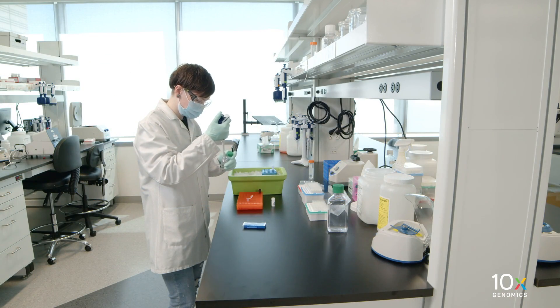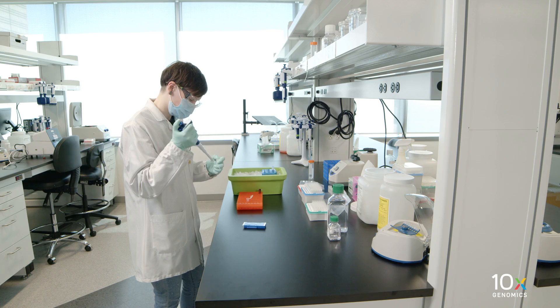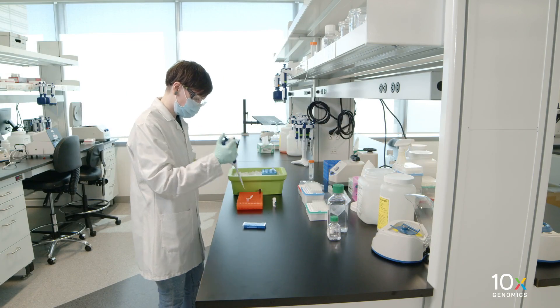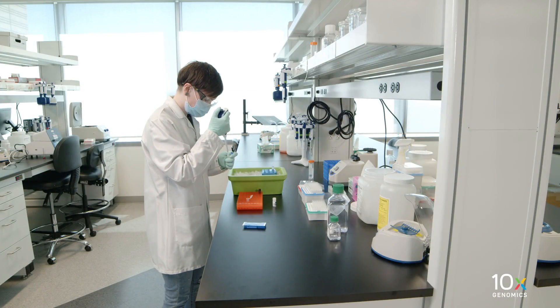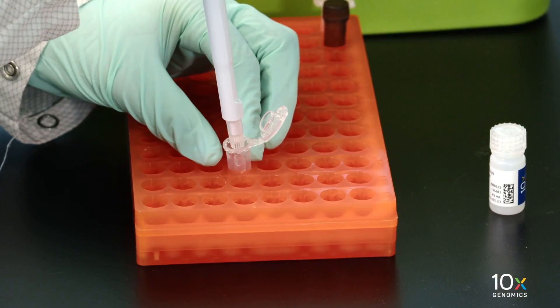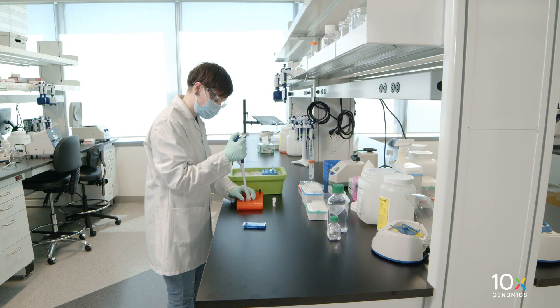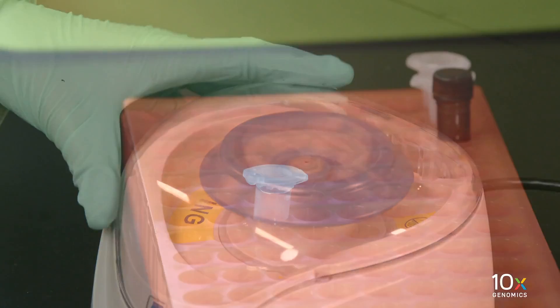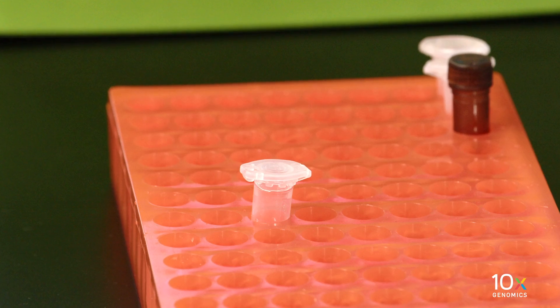Prepare the probe hybridization mix by adding nuclease-free water, FFPE High Buffer, Human WT Probes V2 RHS, and LHS. Pipette mix 10 times and centrifuge briefly. Prepare the probe hybridization mix shortly before use and keep it at room temperature.